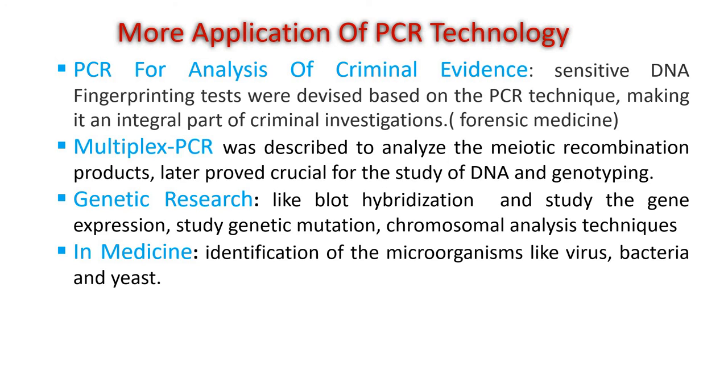Now الثيرد application here هو genetic research، ومثل ما قلنا البلوتينج process هي كلش مهمة بهذا التايب أو الابليكيشن. We can study the gene expression also, we can study the chromosomal analysis and abnormality, allele mutations أيضا ممكن ندرسها عن طريق هاي genetic research by PCR technology. وin medicine specifically in microbiology we can identify specific organisms like viruses, bacteria and even yeast by this PCR technology. فإذا ال PCR wide range of application in life, in medicine and even in the forensic medicine.